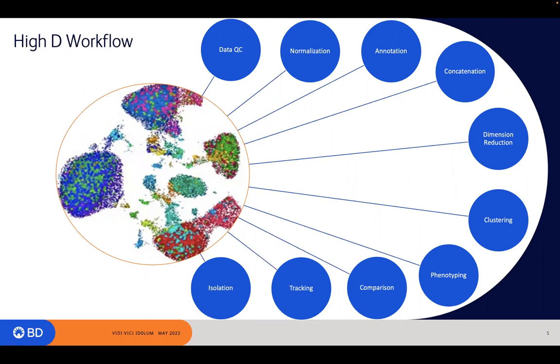So you can see how your cells are changing based on a given treatment, right? Let's say you treat cells with a drug on day 1, and then you want to see what happens to them on day 5, whatever. You will be able to visualize that easily using dimension reduction tools.